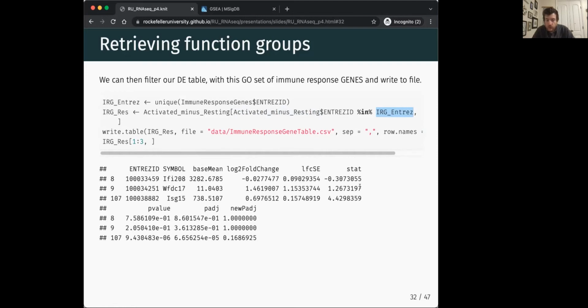Okay, and then you're able to go from your differential gene expression analysis, you find out which GO terms are enriched, then you can actually look back at your differential gene expression analysis at those specific GO terms, and then you can do things like make heat maps like we did in the last session of these GO terms. That's quite a common next step: you'll take this gene set, maybe you go back to the R-log counts, extract out that information and do a nice heat map. Or you'll look at what are the log2 fold change values of this gene set versus several other gene sets, so you can see the amplitude of change.